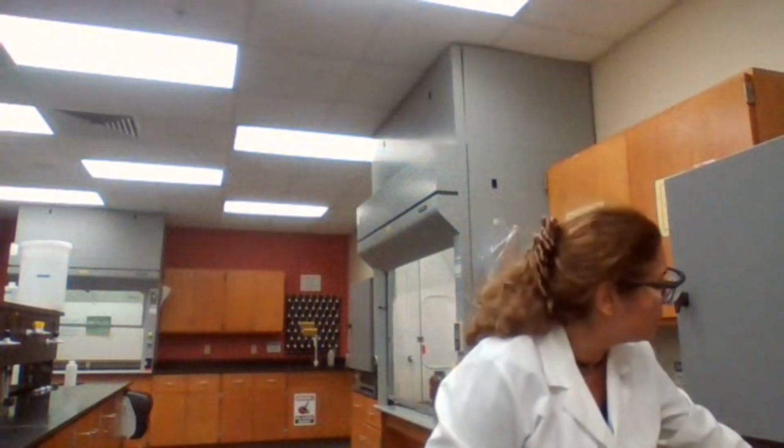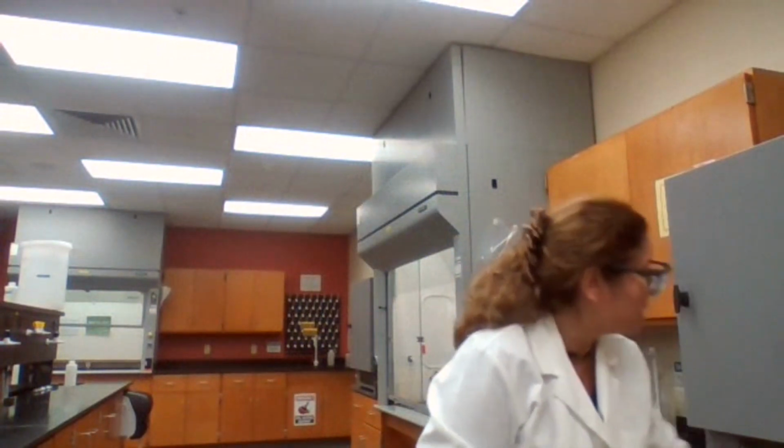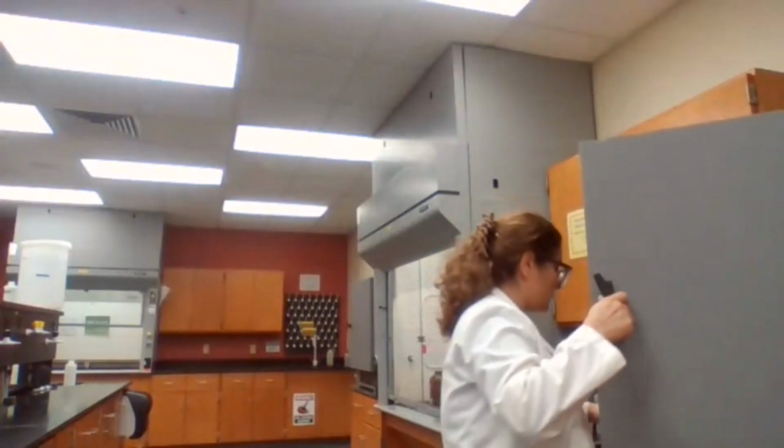So I'm waiting for like 5 minutes. I have to be careful with this oven. I don't want the sample melting in the oven because the solvent is methanol. It evaporates much faster than water. So in 2 minutes, I'm going to try and then continue.